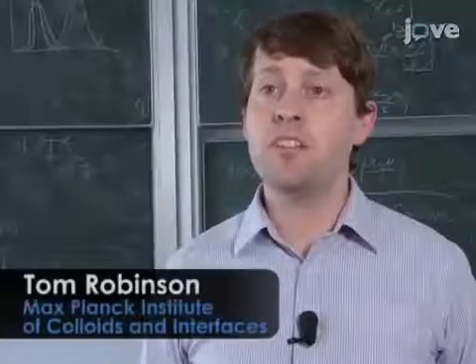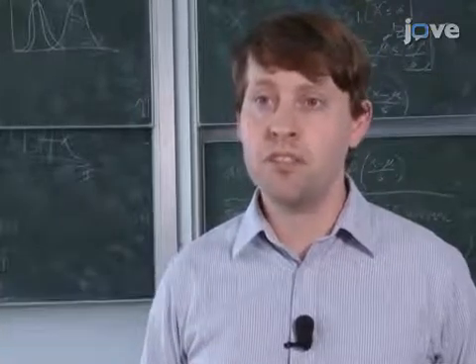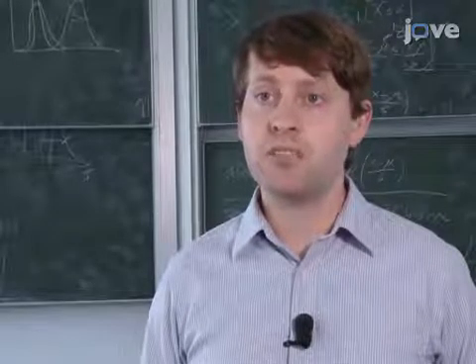The main advantage of our approach is that vesicles can be prepared at physiological buffer conditions, and the microfluidic device can be used to create asymmetric buffer conditions.